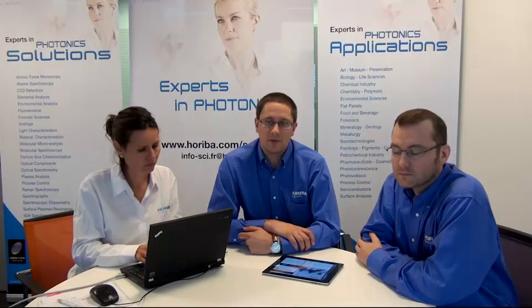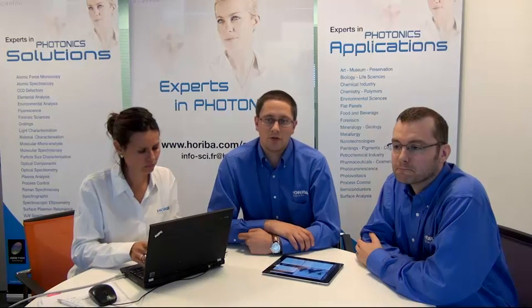And then for the Aqualog, what we still provide in addition is the method and the software package to really dedicate the system to one given application. So everything related to data treatment and extracting the information is dedicated to water analysis and CDOM analysis. This is mostly the main difference from the software point of view.